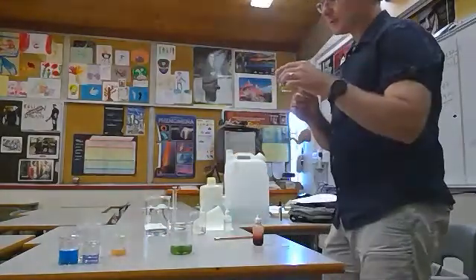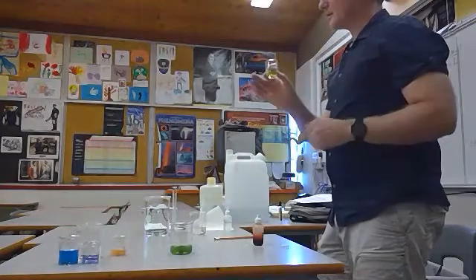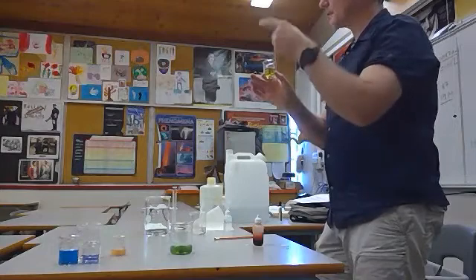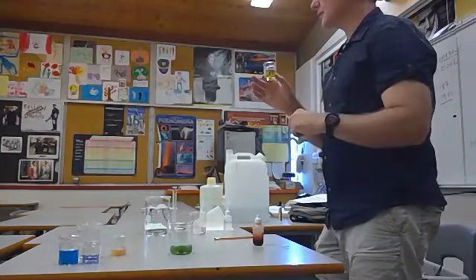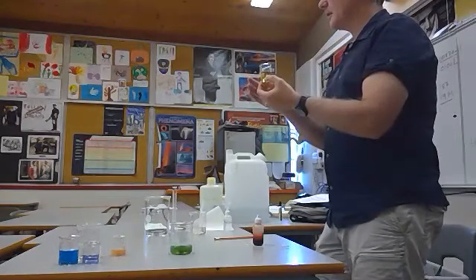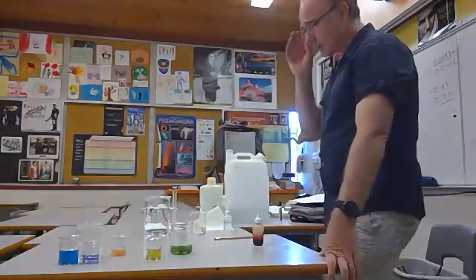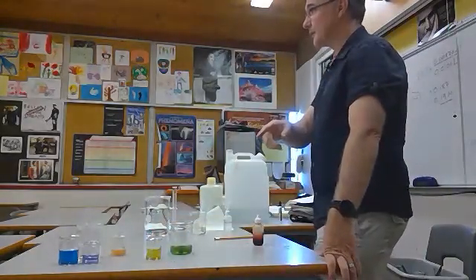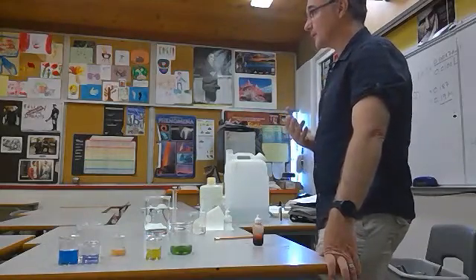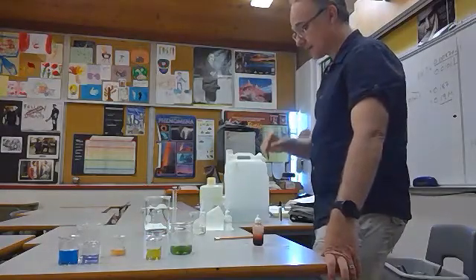What's interesting about this though is this is dissolved CO2, and it's in an aqueous form right now. But if I let this sit overnight, the CO2 that's in here will leave the system, go back to the atmosphere, and this will turn back to green again. So it's an equilibrium between the CO2 in the atmosphere and the CO2 that I put in here. Acid rain generally is more acidic than that though. Places where we have acid rain, you're looking at pHs below 5.6 or something. Normal rainwater coming down is actually partially acidic just because it passes through the atmosphere.